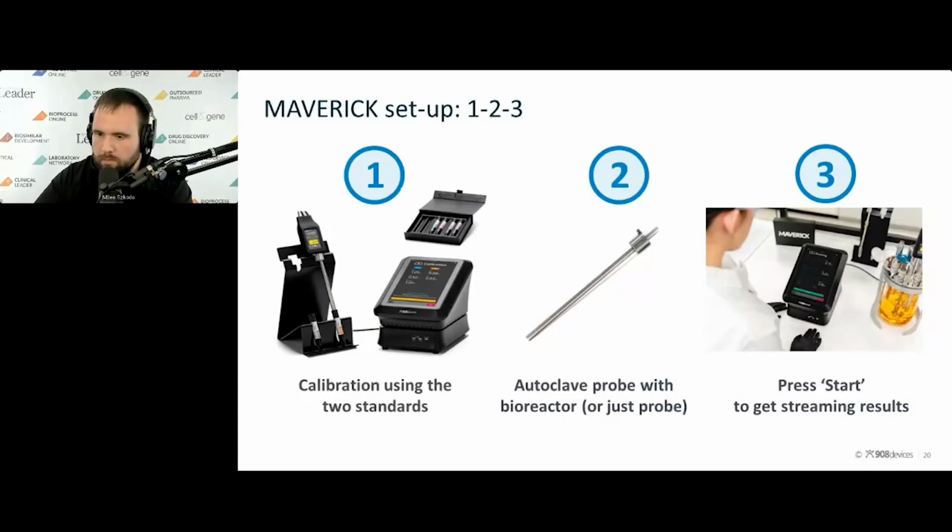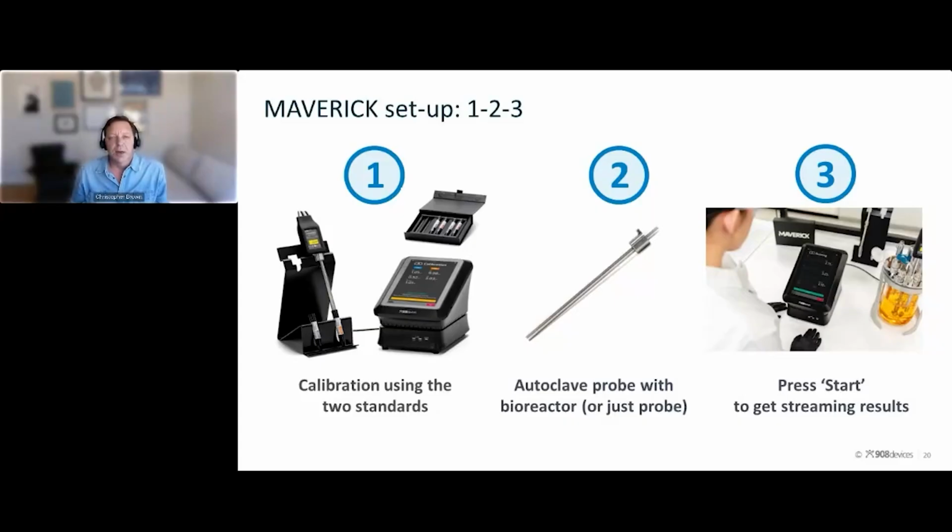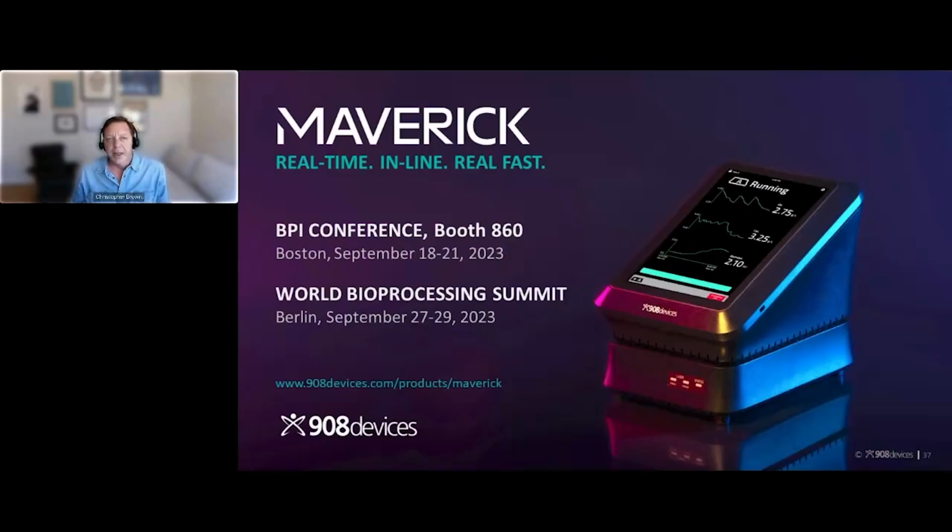Yes, absolutely. We recognize that a lot of groups have some process-specific elements they may be very interested in or are trying to do more, but all that's available with the raw spectral data. At the conclusion of the bioprocess run today, the raw spectral data is exported in a double precision data file that you can bring into any other package to do modeling offline. And the spectral data can come out by OPC UA as well, so you can get real-time connectivity if you're using the Mavericks as OPC UA devices. So both real-time or in one big chunk at the conclusion of the bioprocess run.